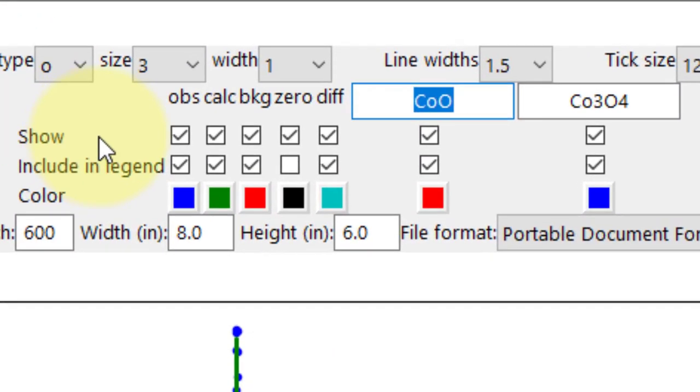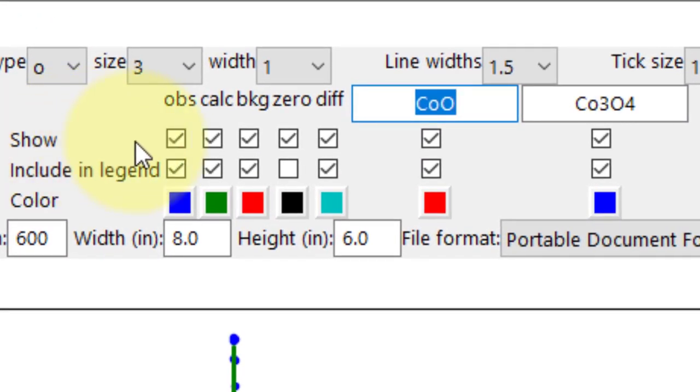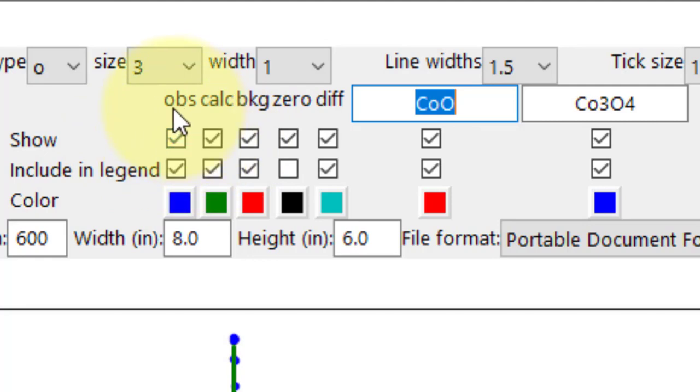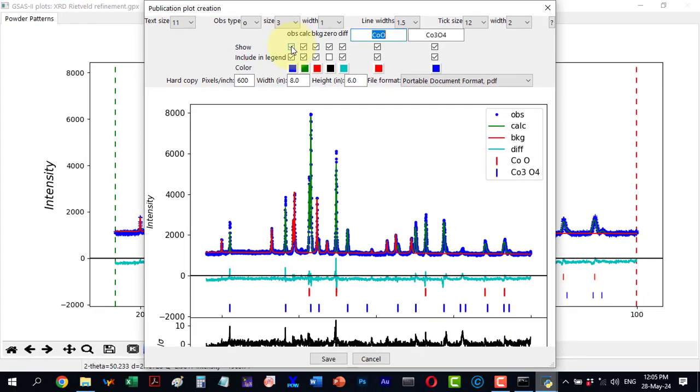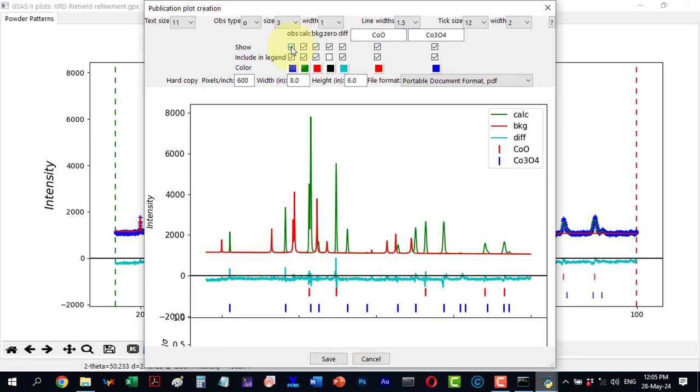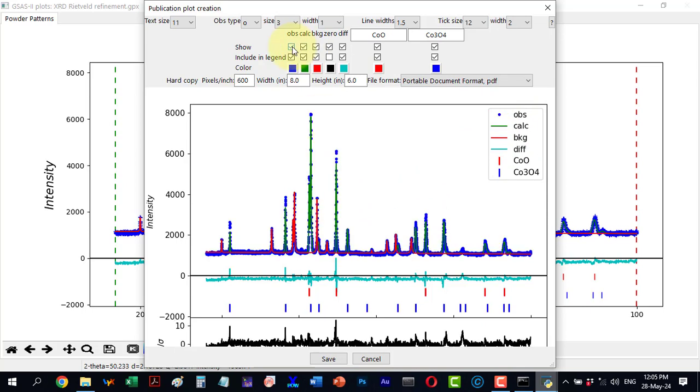There is also an option to show or hide elements. For example, I can hide the observed value by unchecking it, which removes it from the plot. Similarly I can hide the calculated pattern background.